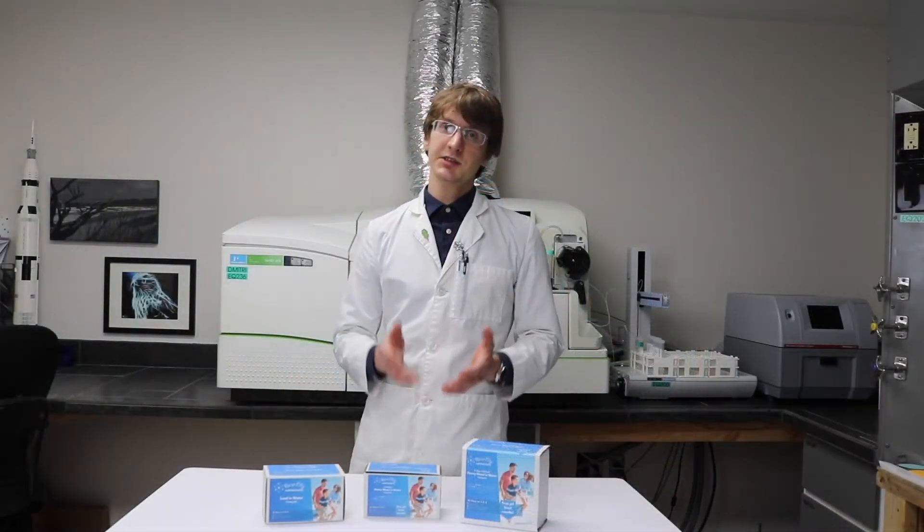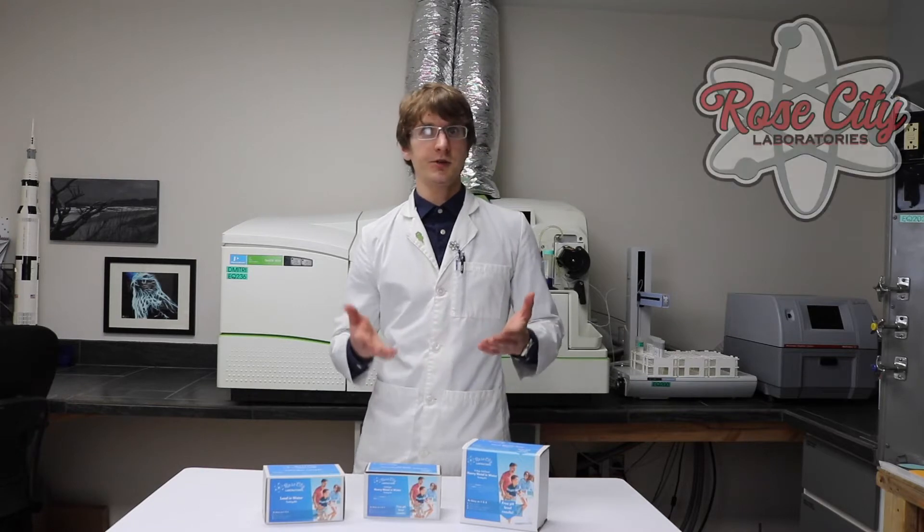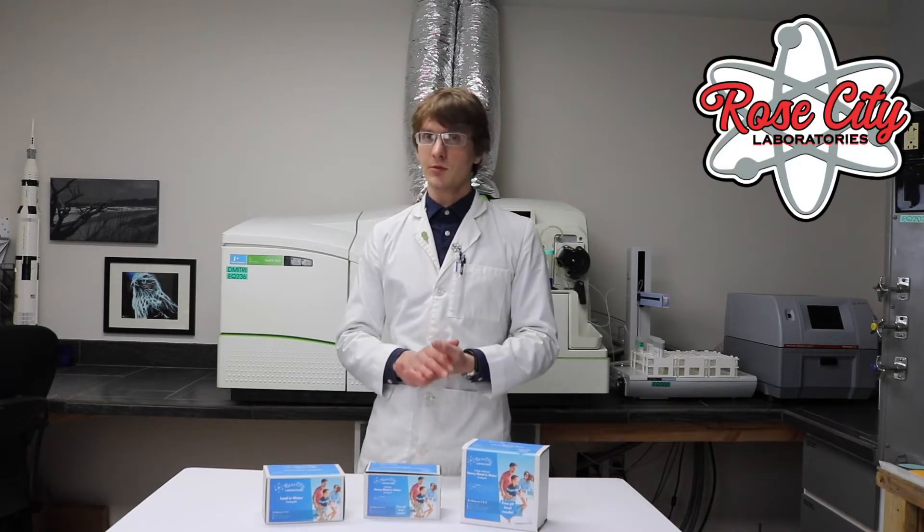These kits allow us to test your water for lead, mercury, arsenic, cadmium, and other heavy metals that may be present.